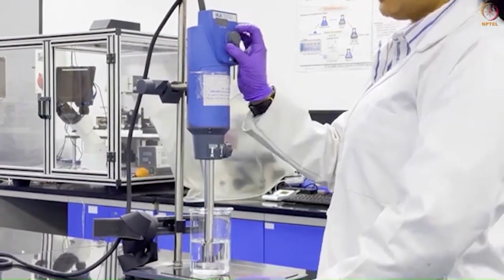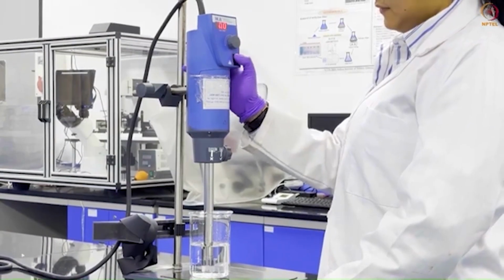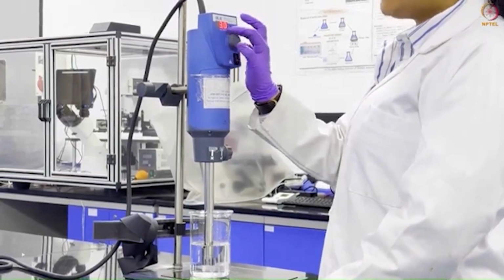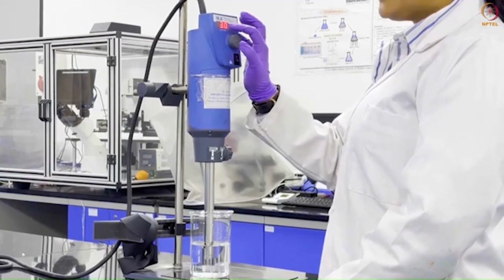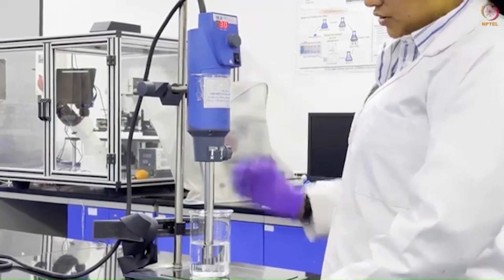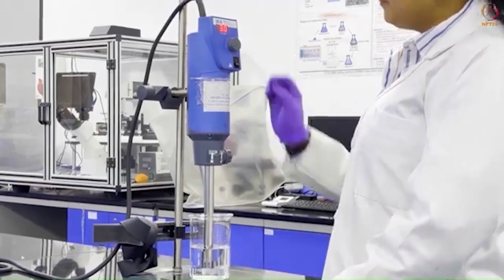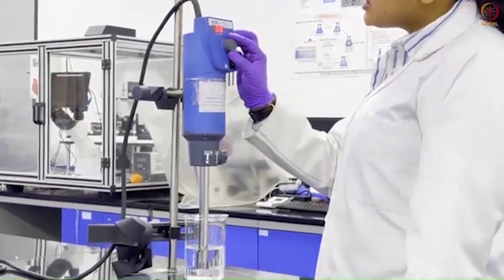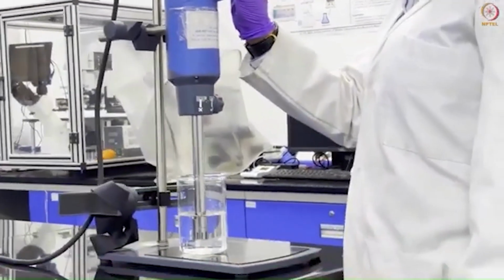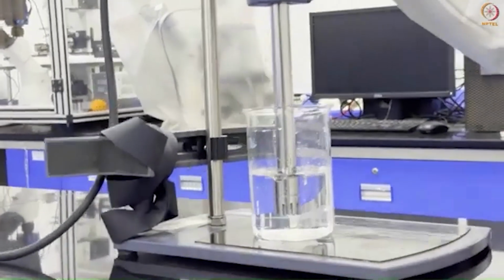As you can see, I have kept it at a low RPM. The RPM that you see here is RPM times 1000. As it is showing 3, it is 3000 RPM. Okay. So now as you can see here, it has started homogenizing the sample. As we increase this speed, we can see that the homogenizing is happening at a faster RPM.